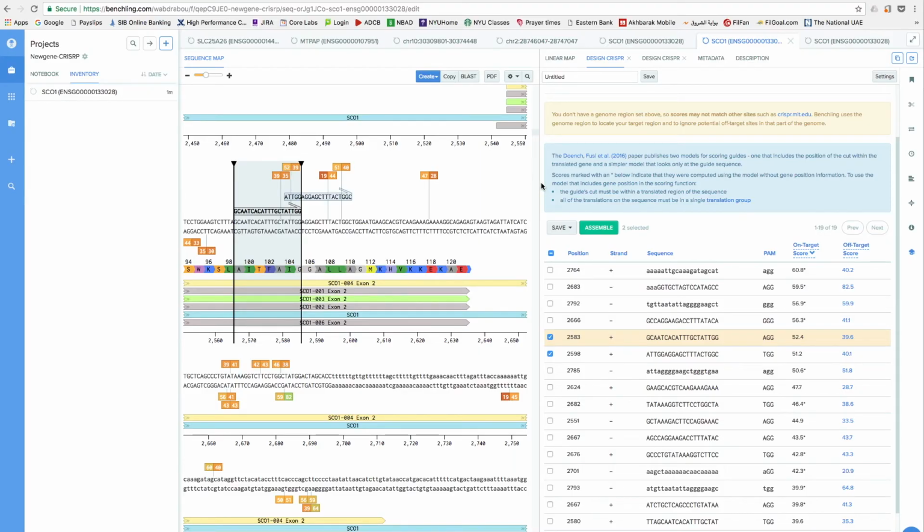and you can start with the ligation process as soon as you have the sequence, and you can integrate it into your CRISPR Cas9 plasmid and carry on with your experiment. That's it. This was a brief summary of how to design CRISPR guides on benchling.com.